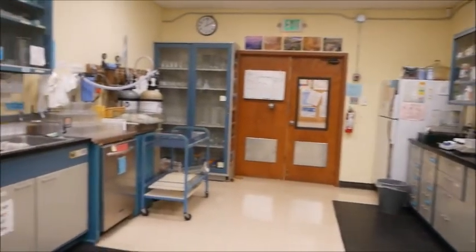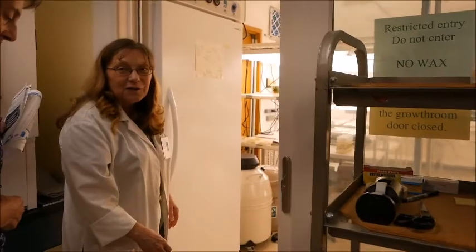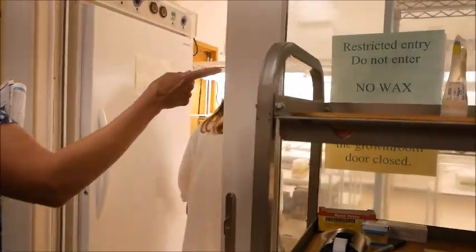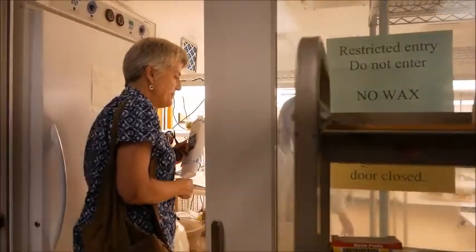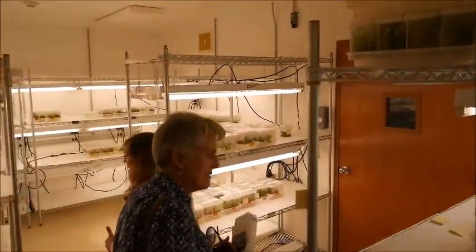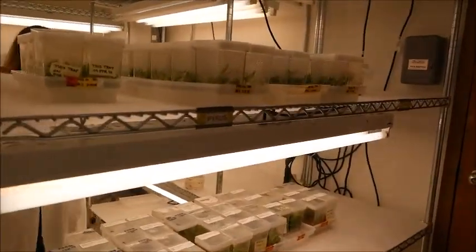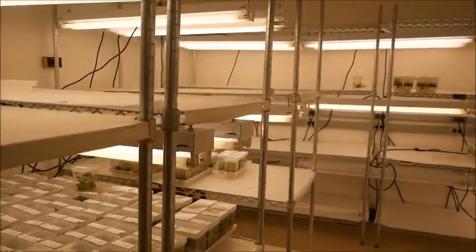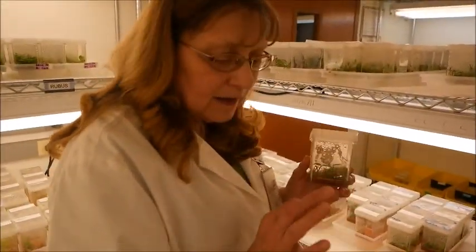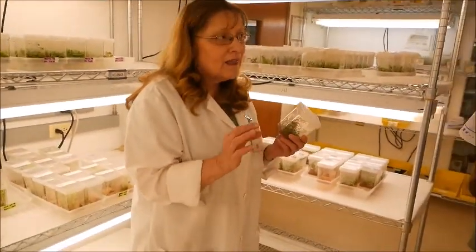Walking into where I have the plants. And I have a mat for people — this is how we keep really dumb people out, we trip them and they fall on their face. They didn't wax in here because this is where we have the sterile plants. So here's a bunch of hazelnuts. These hazelnuts were collected as nuts in Azerbaijan — somebody had gone collecting and brought back nuts.